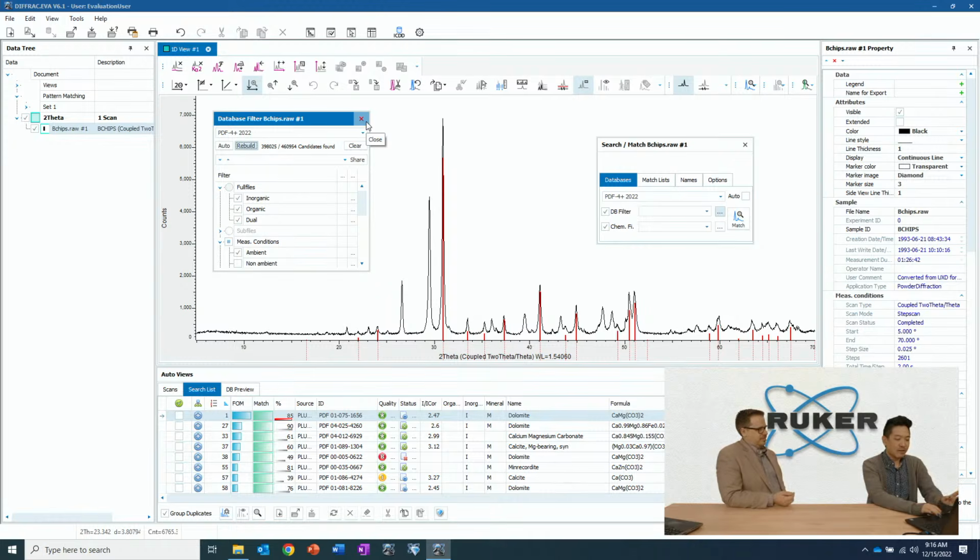And one of the things, if we come back to that whole fingerprint analogy, that I like to do is think about it in terms of having a very curated list, right? So, fingerprints on the glass. Well, you know what? We can say who was at the party to start with, right? Or who was probably. Or if you know that fingerprint was taken in the northern hemisphere, you can throw out everyone who has never left New Zealand. Right. So that's one thing of doing.